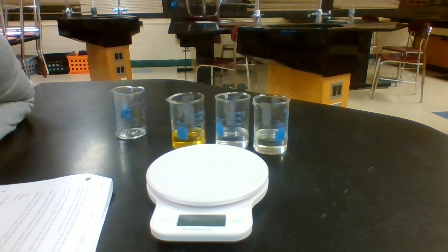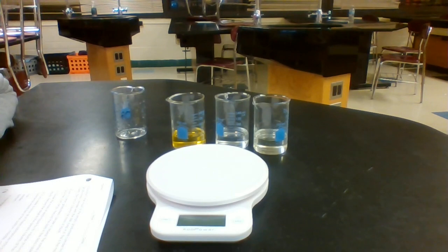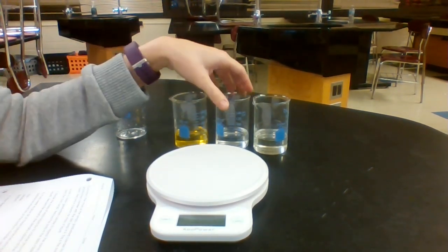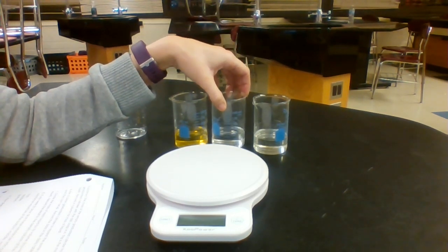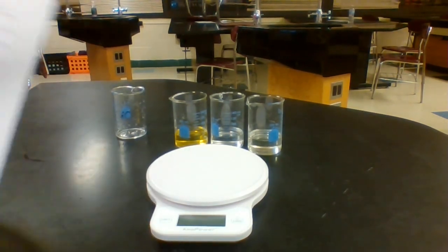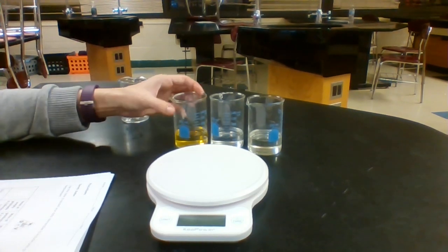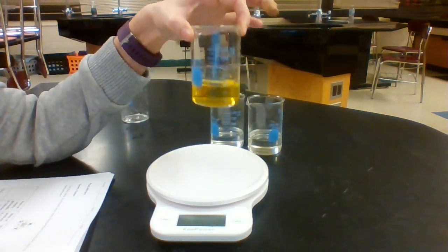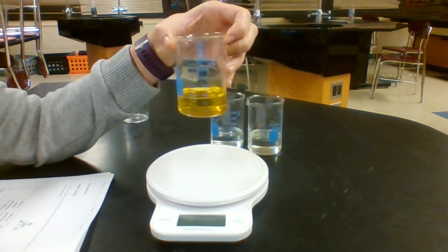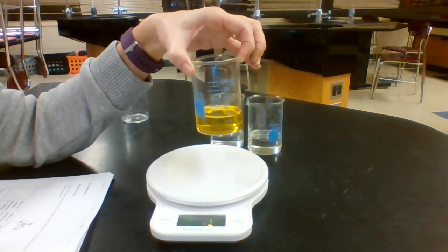For density, I need to make sure that I know the mass and the volume of the substance. So we have 3 different substances that we are going to test today. I have dish soap, I have rubbing alcohol, and then I have corn syrup. So the first thing that we need to do is get the volume. And the cool thing is that for a liquid, in order to find out how much space this liquid takes up, we can use what's called a calibrated container. I just pour the liquid into the container and it tells me how much space it takes up.